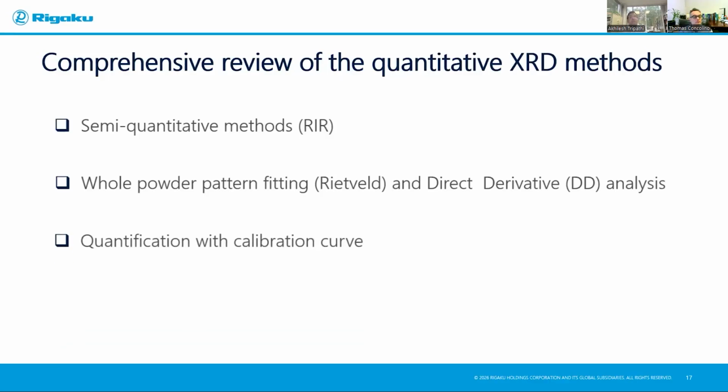And the next one is quantification with calibration curve. We have heard about this a lot, and I'll cover the 3 different calibration curve methods that are available. At times, I also hear a lot from our customers, they want to do quantification of amorphous phases. So we will look into that aspect too today.